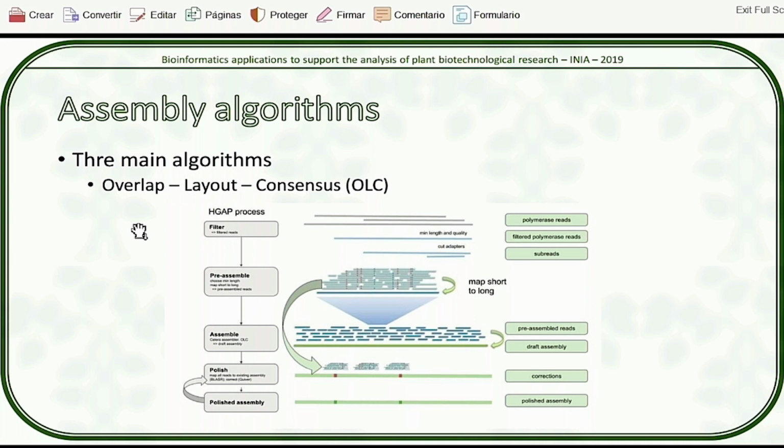But with longer reads, the number of regions in the genome that we can consider unsolvable repeats decreases, and decreases dramatically. So most of the repeats can be solved, and therefore the layout part, the part where you order all the reads that you've managed to align to each other into something more sensible, becomes easier. So this will take a lot less time. And finally, consensus, we already agree that the consensus is, I would guess, the simplest part of it.